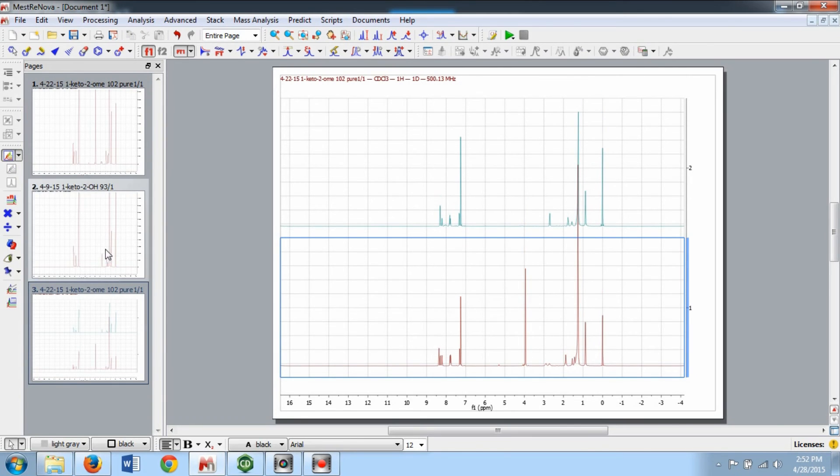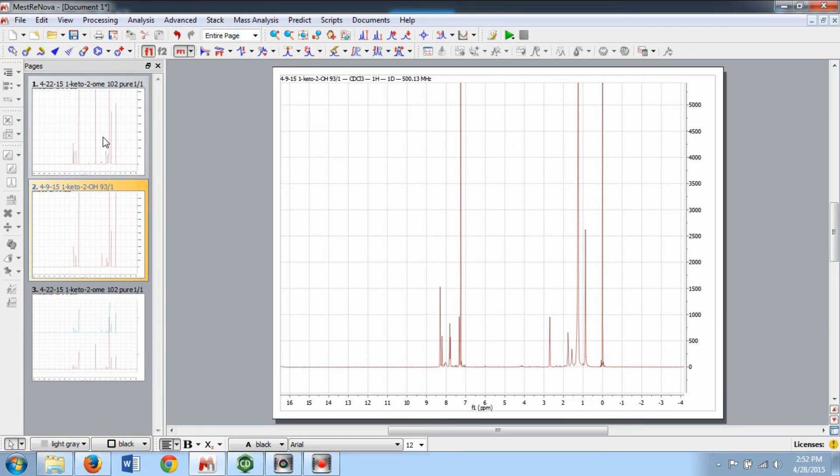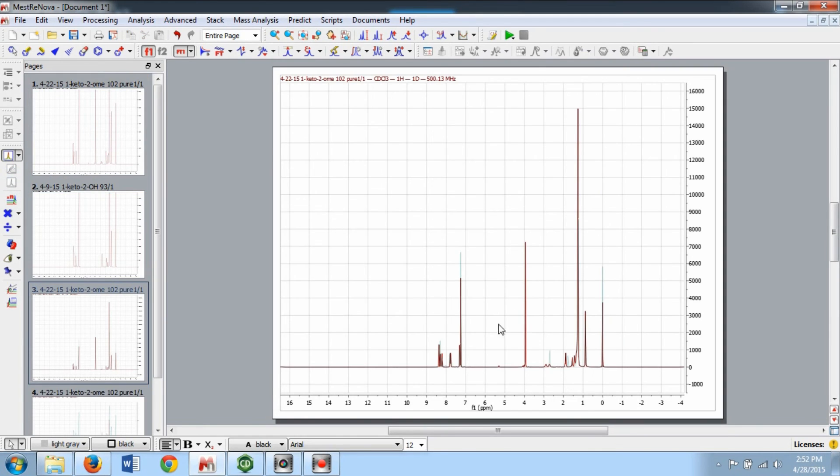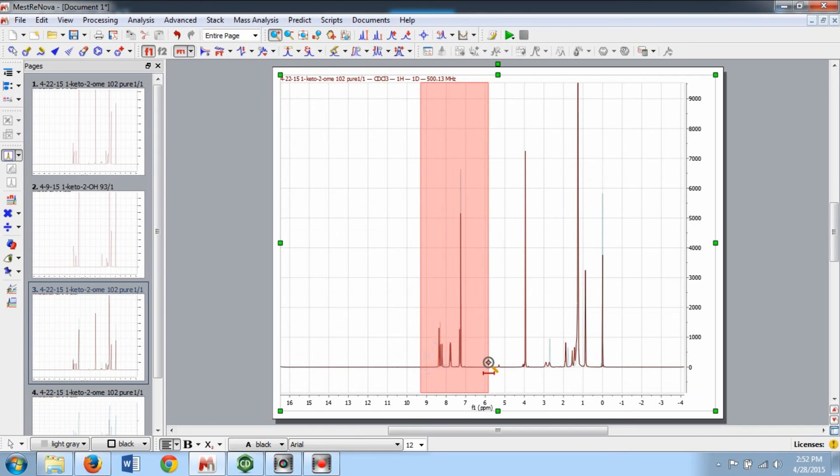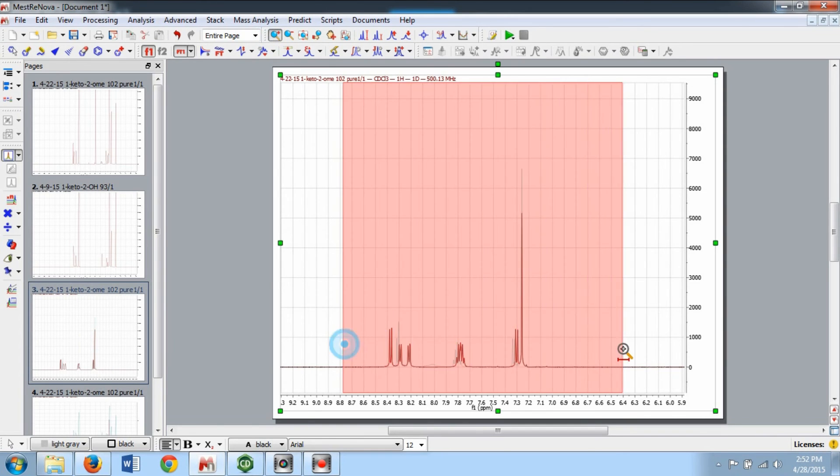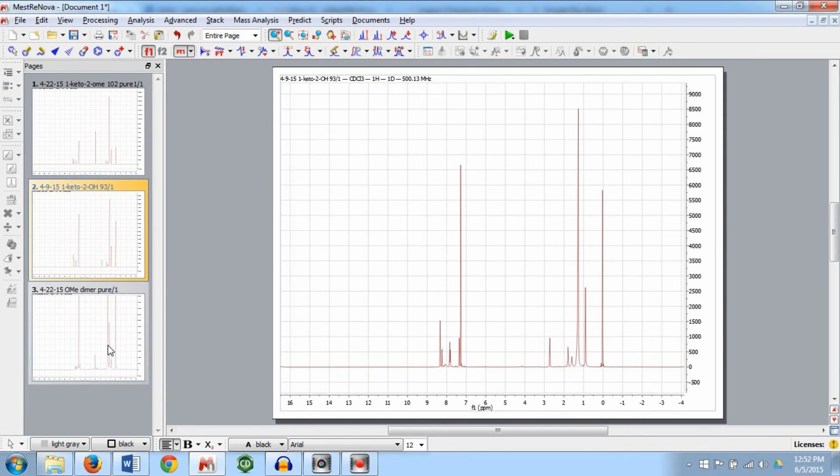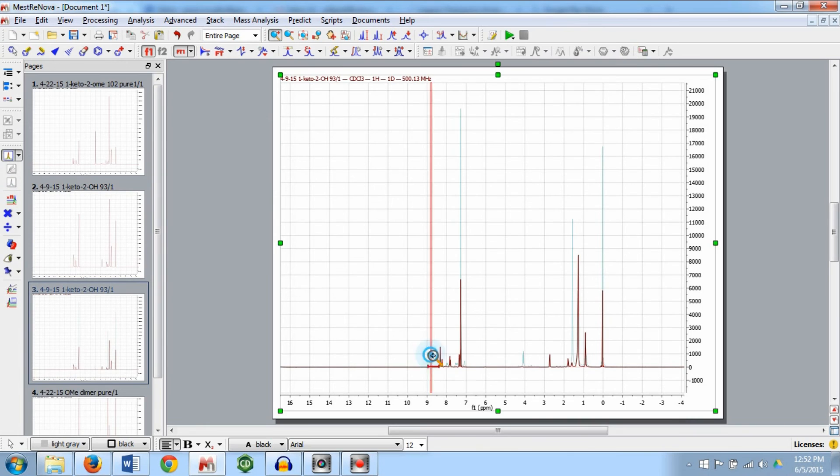The Stack Spectra command will put all of the selected spectra in the same page but not overlapping. The Superimposed Spectra command will take the selected spectra and put all of the traces right on top of each other in the same spectrum. These features can also be found in the Stack menu option.